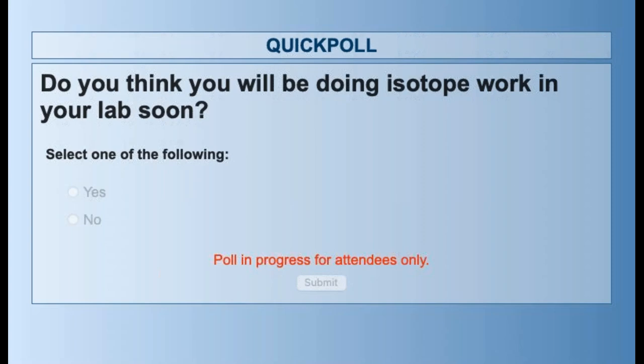It's open. But I want to know, given what I said and the fact that the column and doing the separation is probably the hardest part, the instrument itself probably does it pretty easily. Yep, everybody's tuned out. Oh, there we go. People woke up. Yay.